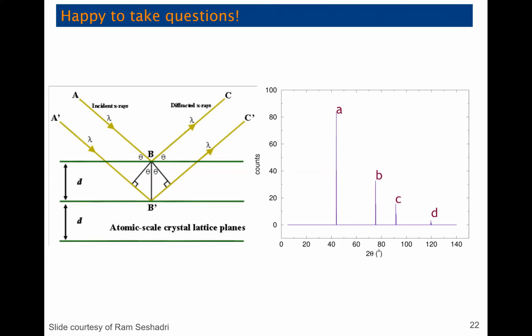Okay. So I want to ask a question regarding basically, if I get a sample and it's just a mystery sample, how do I go about deciding whether X-ray diffraction is for me? Given how easy it is to do a lab XRD experiment, I would probably just say do it anyway. There's no downside.